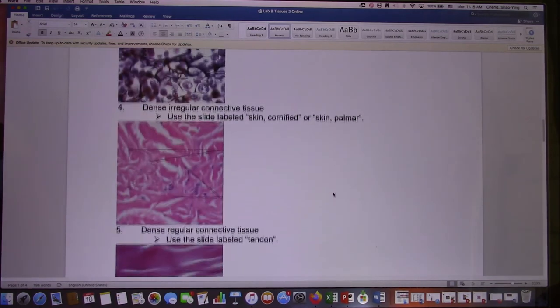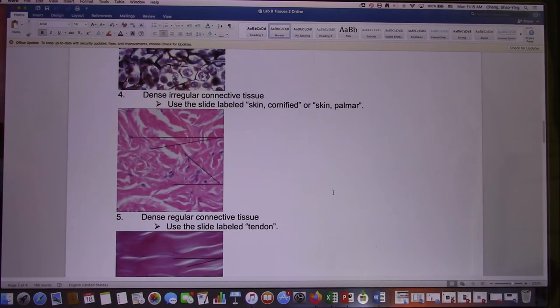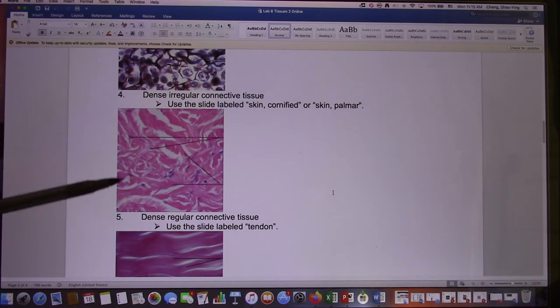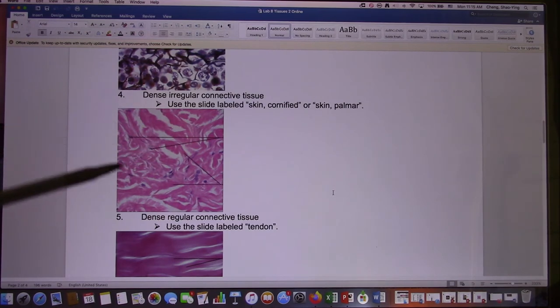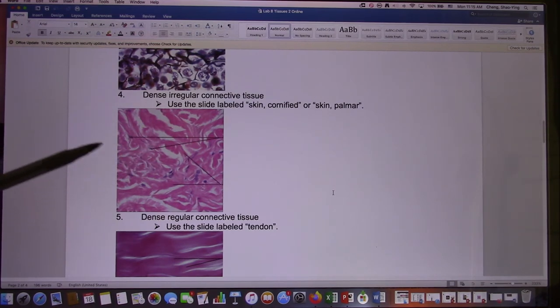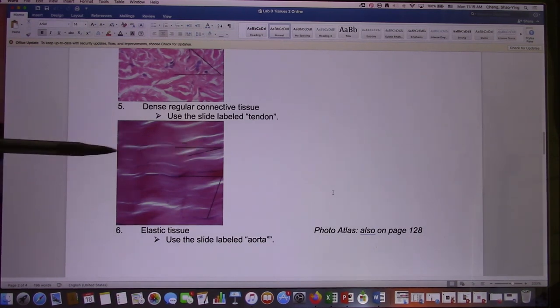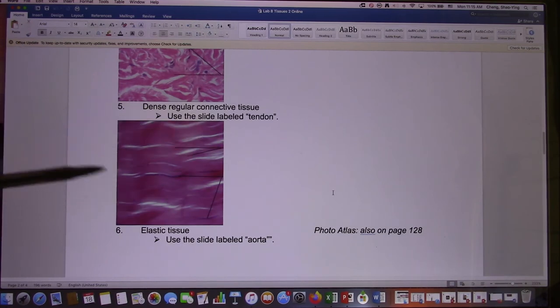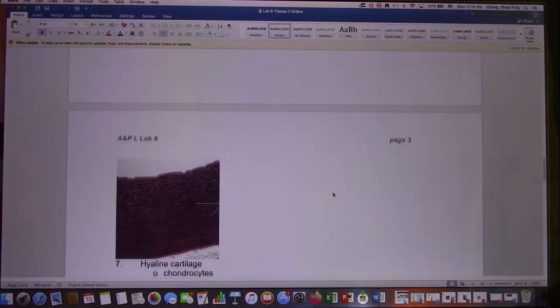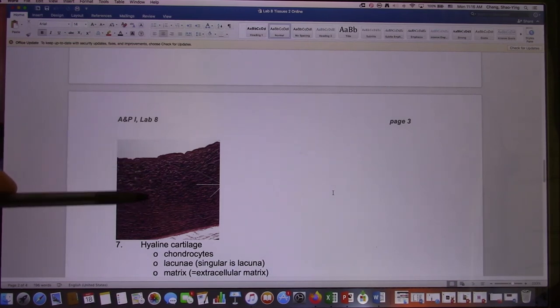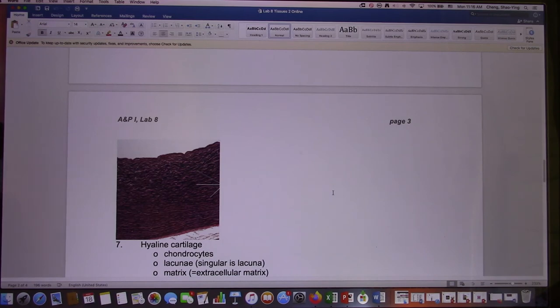Now let's look at some dense connective tissue. We have dense irregular — it has a lot of fiber but they are irregular compared with dense regular. Dense regular comes from tendons and ligaments and the fibers line up pretty well. And elastic — elastic has a lot of elastic fibers; the dark colors after staining are the elastic fibers. These are the characteristics of elastic connective tissue.